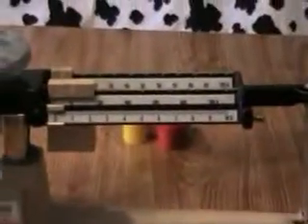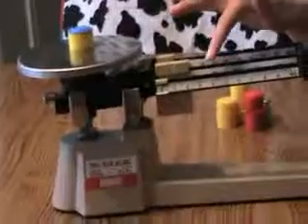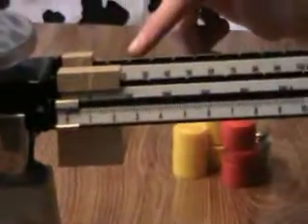You put your weights on the scale. Now there are three beams on a triple beam balance, hence it's called a triple beam balance. The first beam measures by ones — one, two, three, four, five. The middle beam measures by one hundreds, and the last beam measures by tens.